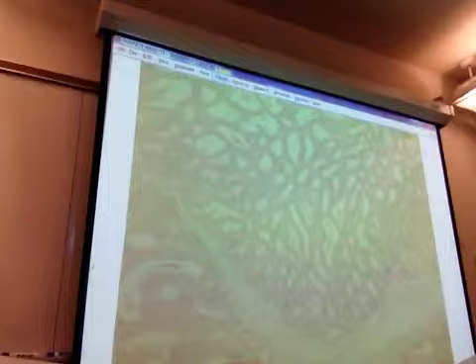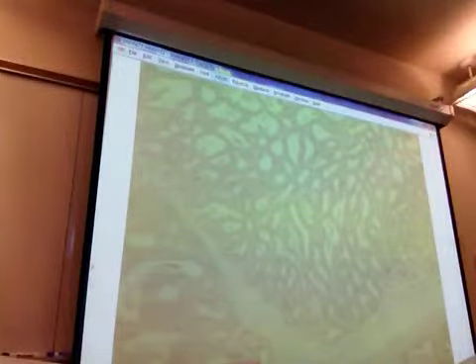So the seminal vesicles themselves look rounder. Notice they're packed closer together, and they don't look leafy. They don't look like fern fronds. And if you guys get this slide, I'm going to go to higher magnification too. And I'll go to higher magnification on the prostate as well.